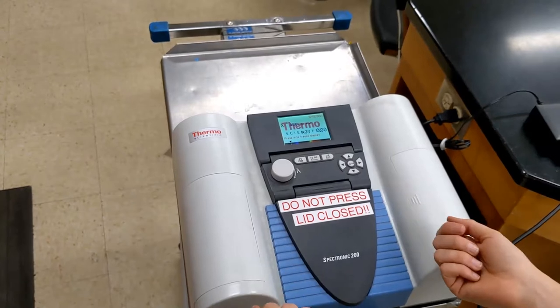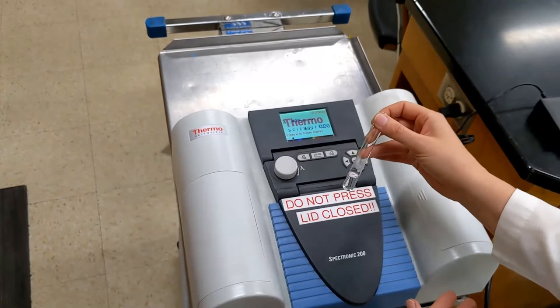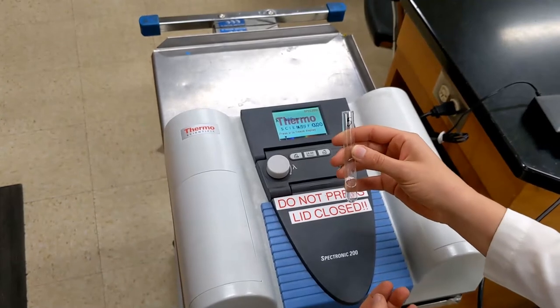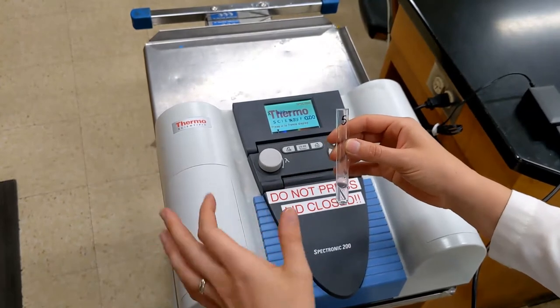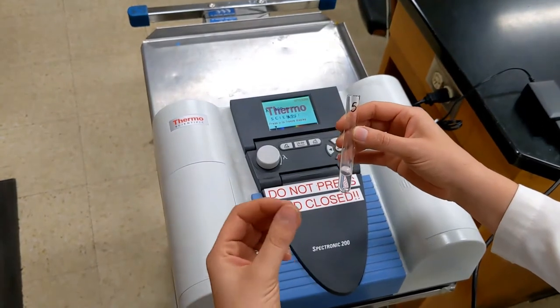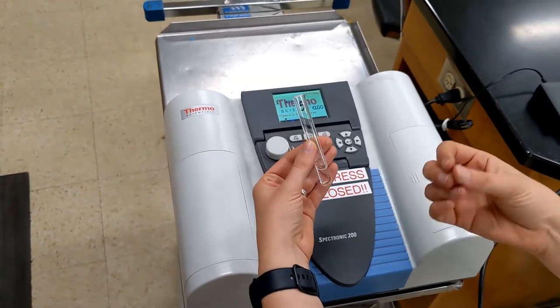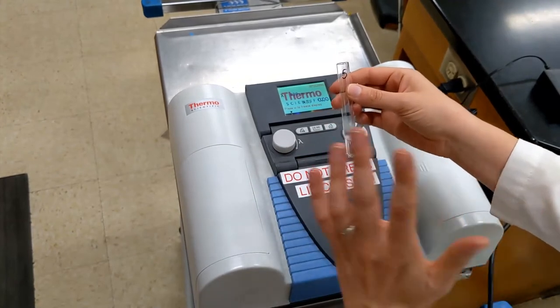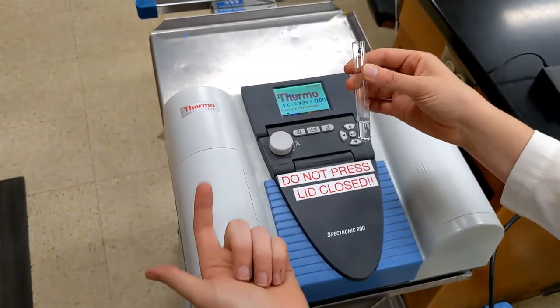The first thing you will do is use a blank. What we have in this blank is everything except for the trypsin and the calcium chloride. This tells the machine what parts of the solution to ignore in its calculation. What we actually want to measure is the yellow pigment produced by the digested Bapna — we do not want to pick up any residual absorbance from the trypsin or the calcium chloride.